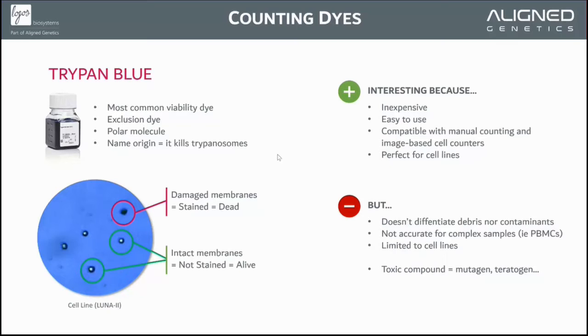Another aspect is that this is a highly toxic compound. This is a mutagen, a teratogen, and a carcinogenic compound. So anytime you're working with Trypan Blue, be careful and use gloves. If you have some Trypan Blue on the surface, consider it as contaminated and decontaminate the surface.